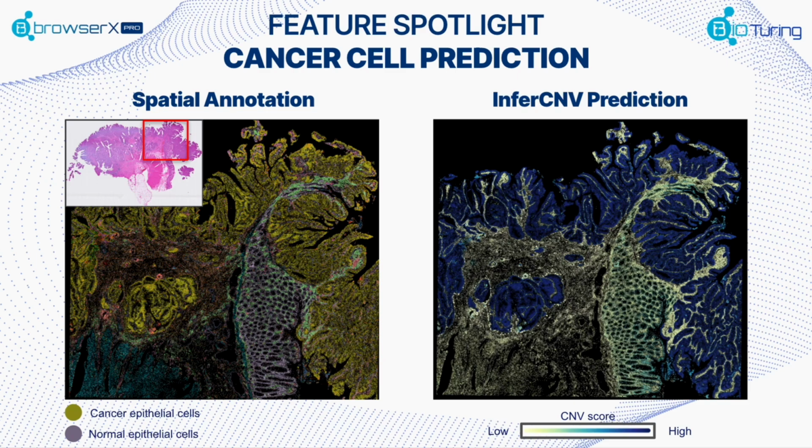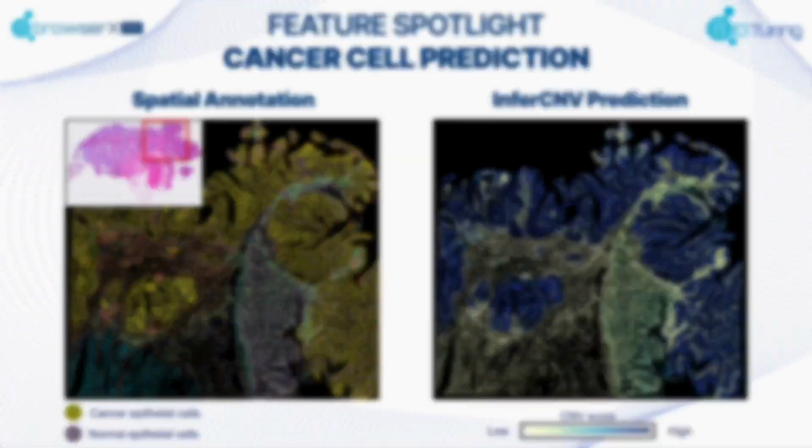As mentioned previously, the cancer cell prediction tool is mainly used to discern heterogeneous cell populations within a tumor. However, this tool can also be used to identify potential subtypes of a diseased population. For example, if a few subjects within a diseased population exhibit a proportion of cells predicted to be cancerous, this may be indicative of a more severe diseased phenotype, and it may be of interest to explore the subpopulation further.